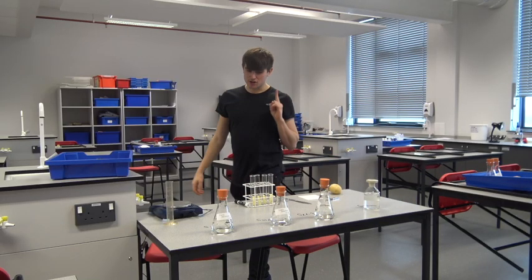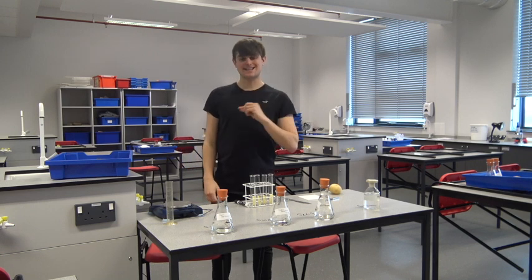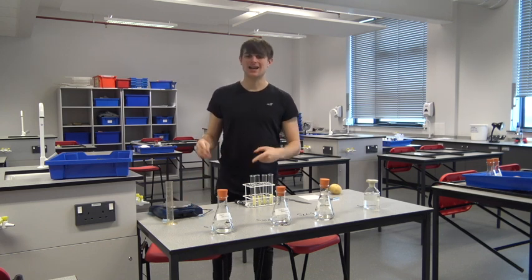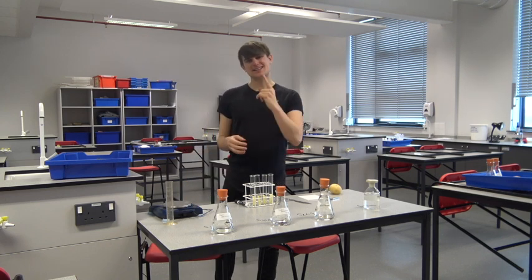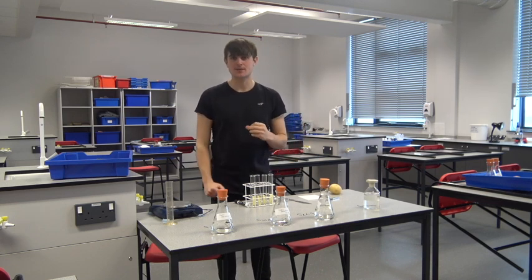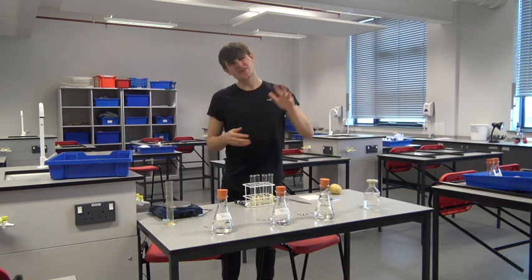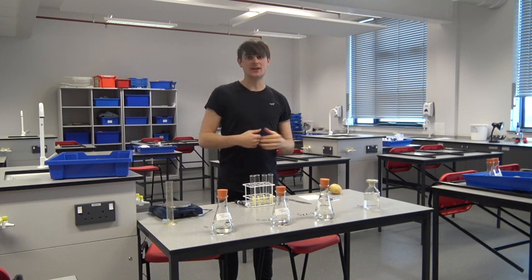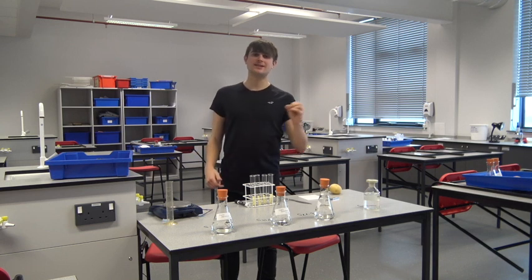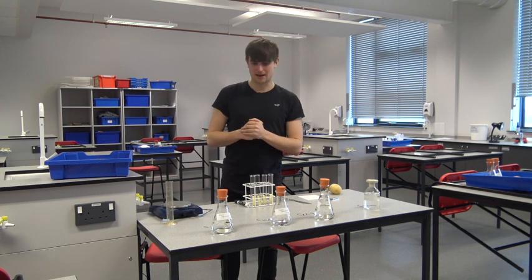It's incredibly important that you record the starting mass of each of the potato chips, because what we are going to do now is add different salt solutions of water to these potato chips. We are then going to leave it for some time — maybe half a day, maybe even overnight — and then come back and see whether the mass has increased or decreased, whether water has gone inside or come out of that potato chip.